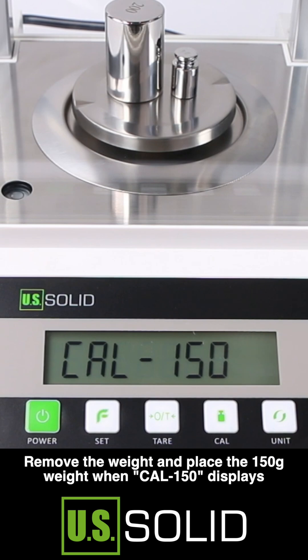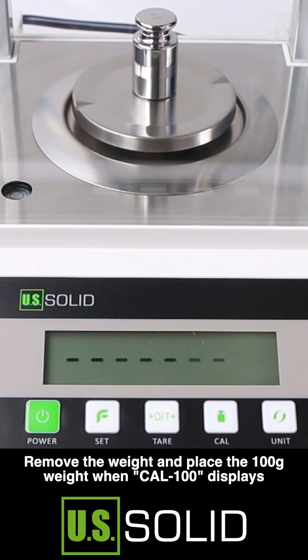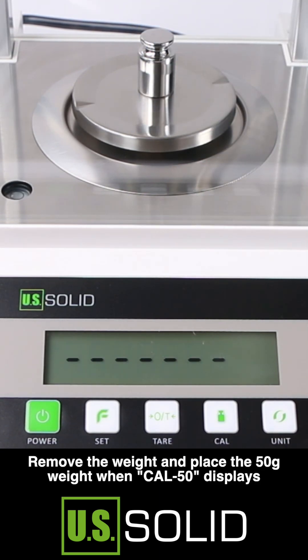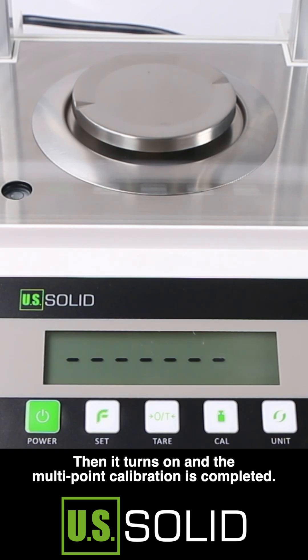Remove the weight and place the 150 gram weight, then remove it and place the 100 gram weight. Remove that and place the 50 gram weight. Remove the 50 gram weight when the display shows calibration. Then the balance turns on and multi-point calibration is complete.